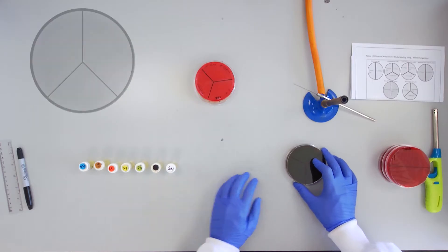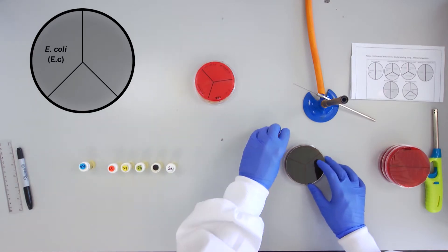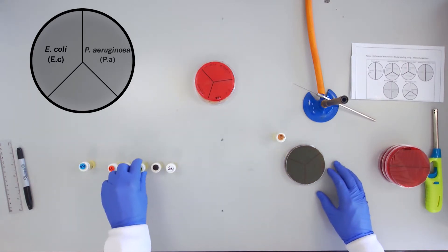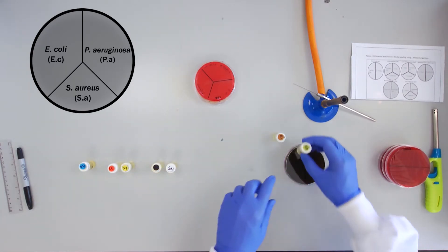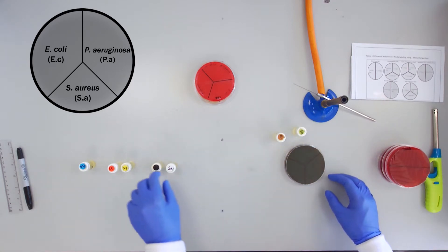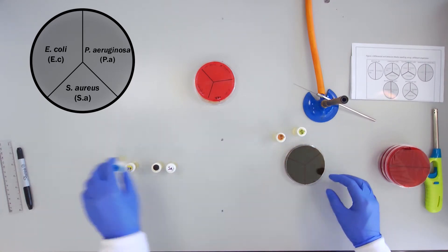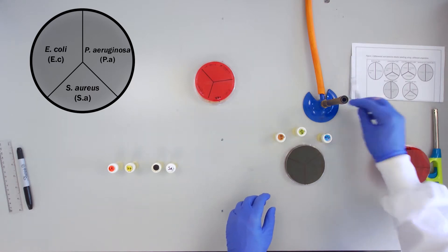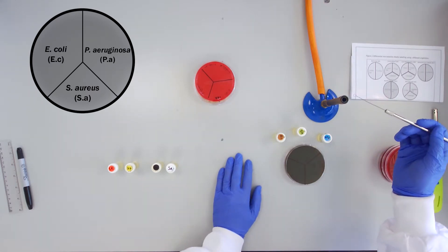The eosine methylene blue plate or EMB is a brownish color and will be inoculated with E. coli, Pseudomonas aeruginosa, and Staphylococcus aureus.